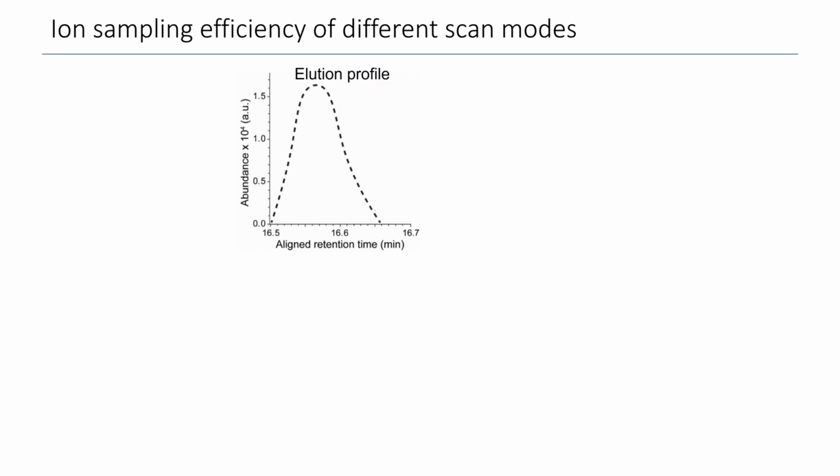So you could imagine as the peptide molecules come from the column, they would elute with a peak shape, something like this. And then when we look at the fragment ions that we would sample from this very peptide in data-dependent acquisition, we would most likely sample it somewhere at the beginning of the peak and actually turn just a very small portion of these ions into fragment ions.